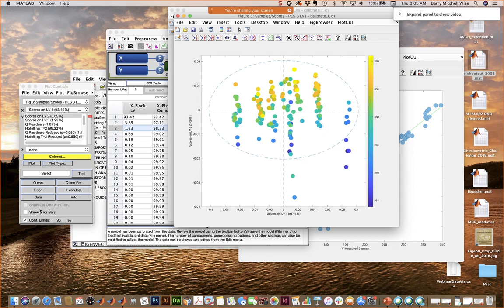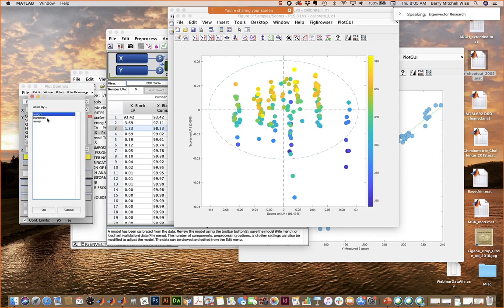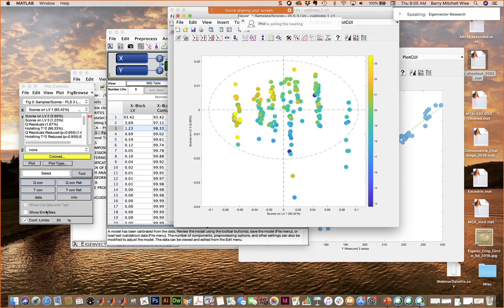And that suggests to me that there's a geometry or a density issue that's causing the scatter that goes up and down. And it's actually even interesting to color this one by the hardness, and you even see some trends in the hardness here, where the hardest tablets are up here and the softer ones are here.